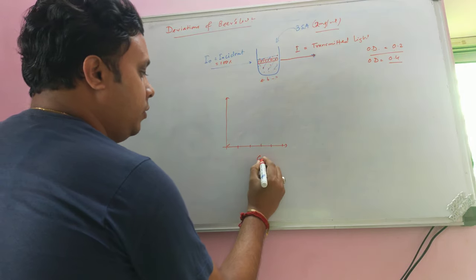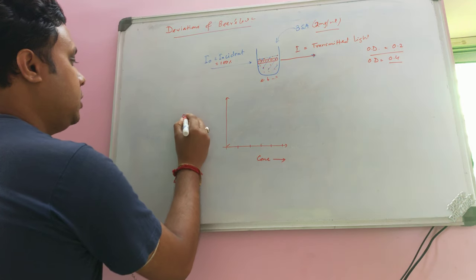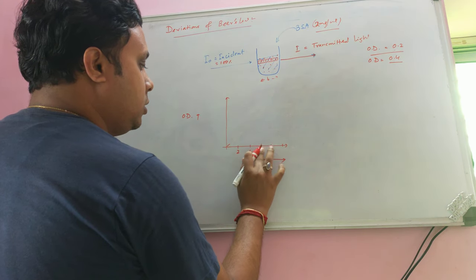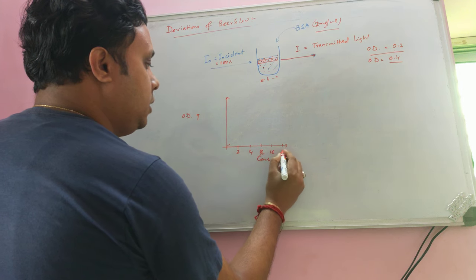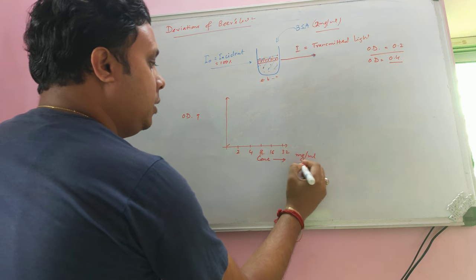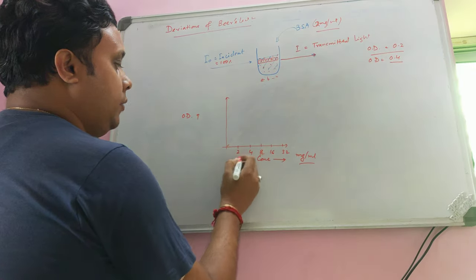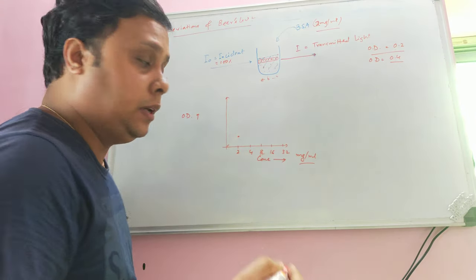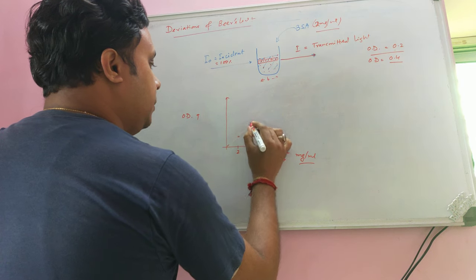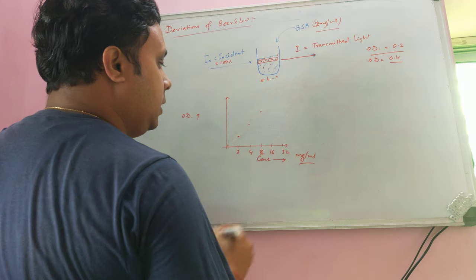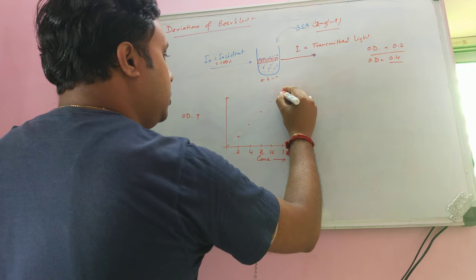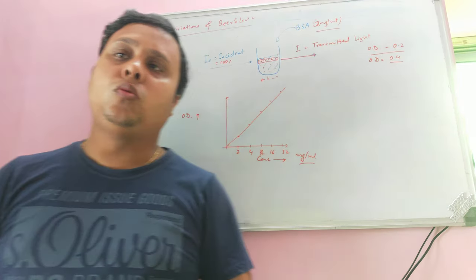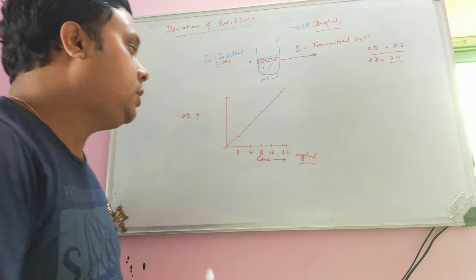If we plot concentration on the x-axis and absorbance on the y-axis, and increase concentration from 2 mg to 4 mg, 8 mg, 16 mg, and 32 mg per mL, Beer's Law predicts a perfectly straight line — doubling concentration doubles the OD. However, in practical aspects, when you plot OD against concentration, you can get either a positive deviation or a negative deviation.